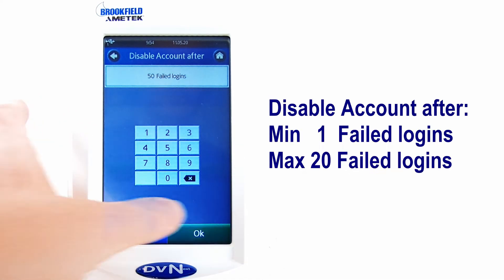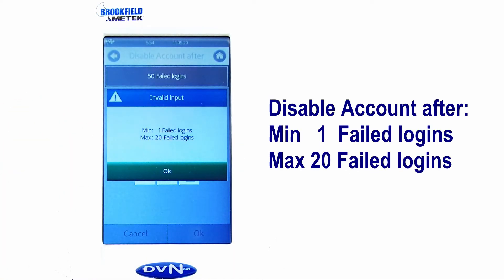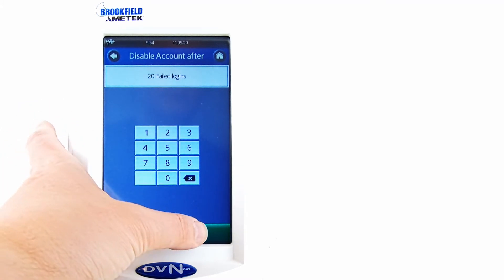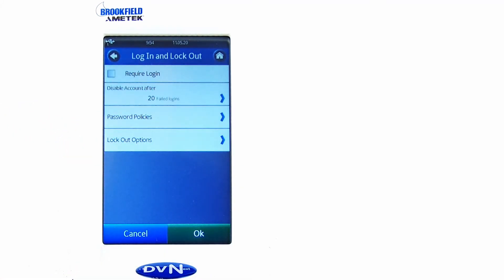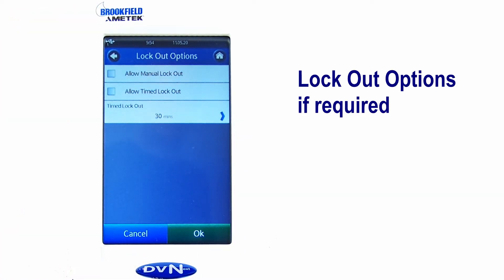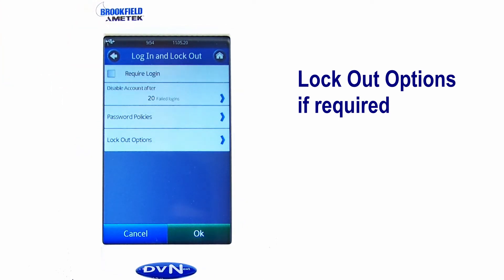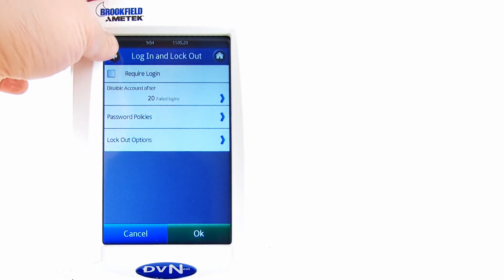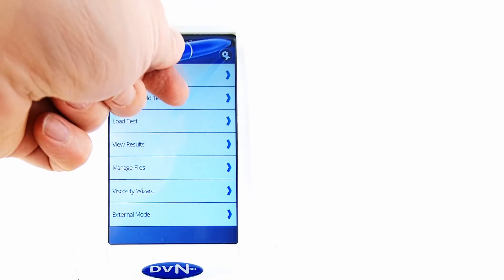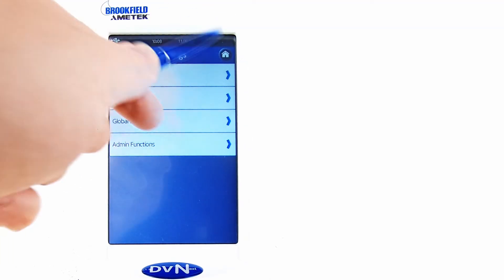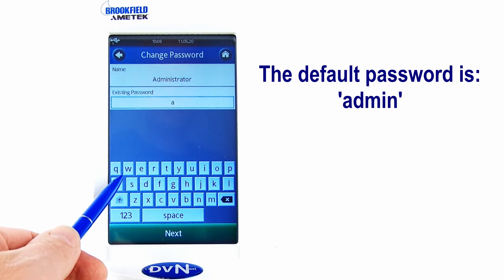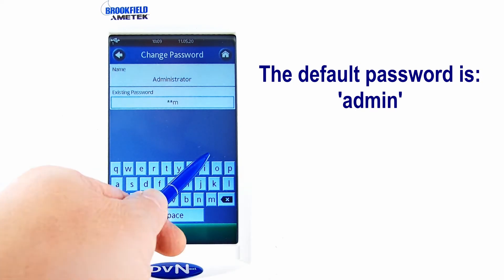Now, let me look at the settings. Now we are changing the administrator's password. If you have a brand new instrument, the preset of the administrator's password is always "admin".